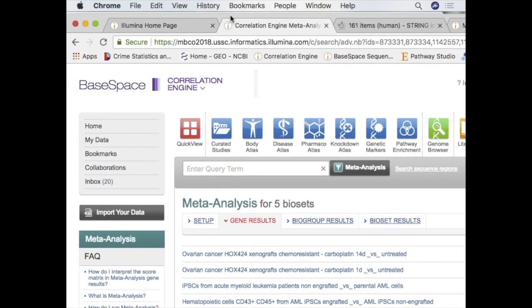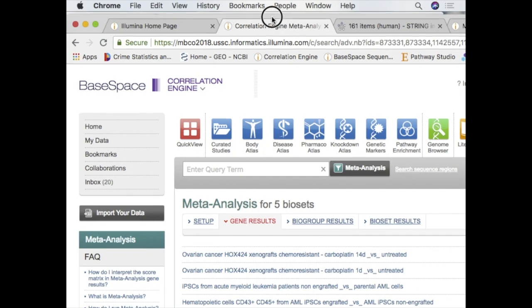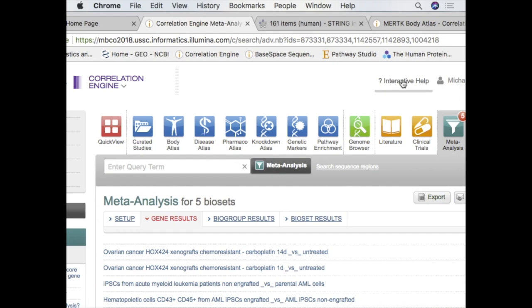I think there's a lot of programs that are kind of replicating what this is, and you could probably find different programs that do different tabs, but I think this thing kind of brings it all together, and what I like about it is you can do interactive help. So you can actually click on that, and as you're going, you will get help. It'll tell you what things mean and what things don't mean. I'm a hippie at heart.